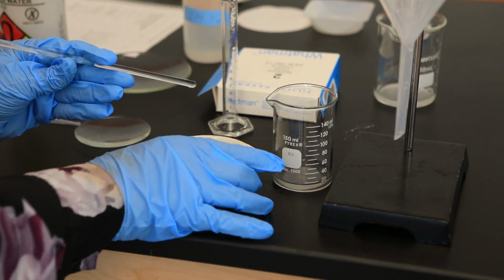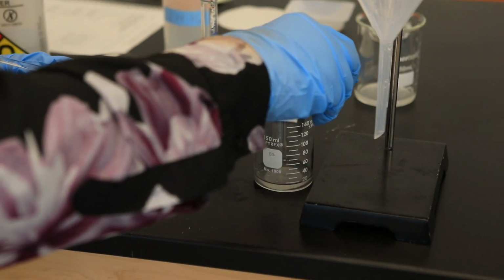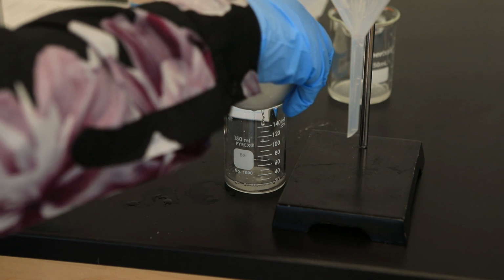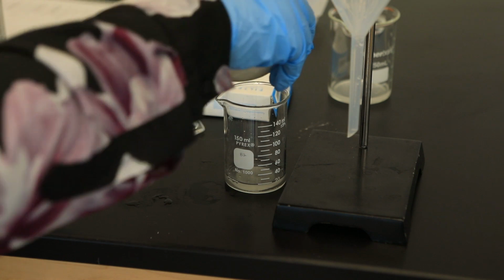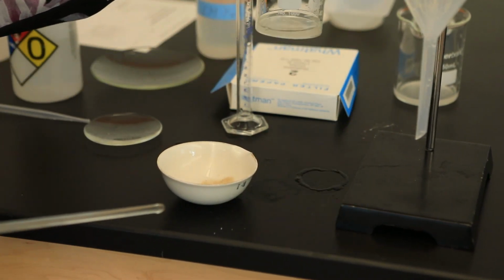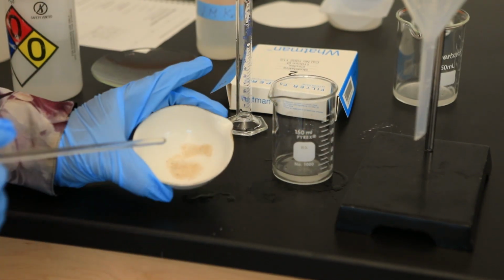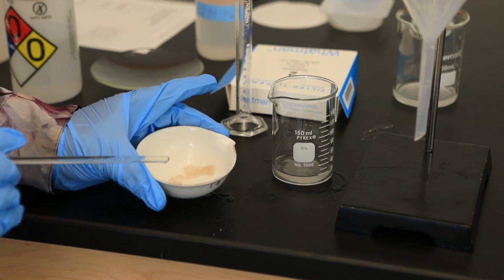Again, I'm going to take this solution and transfer it. Hopefully it's settled. I'm going to transfer it again to my calcium chloride. Beautiful. And so now, in this container, what do we have? Well, this is water, calcium chloride solution. Inside my evaporating dish is my sand, from which hopefully we've removed all the HCl molecules.